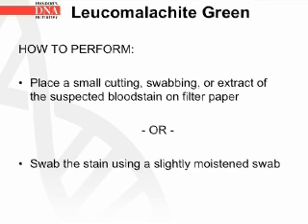How to perform the Leuco-Malachite green test. Place a small cutting, swabbing, or extract of the suspected blood stain on filter paper, or swab the stain using a slightly moistened swab.